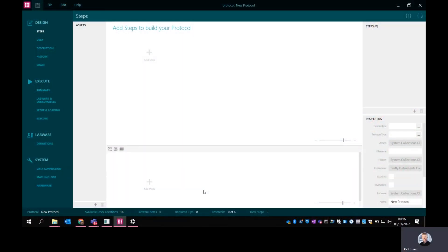I'm going to give a short demonstration of the Firefly software. I'm going to show how to build a simple protocol and then the steps you can go through in executing that protocol.